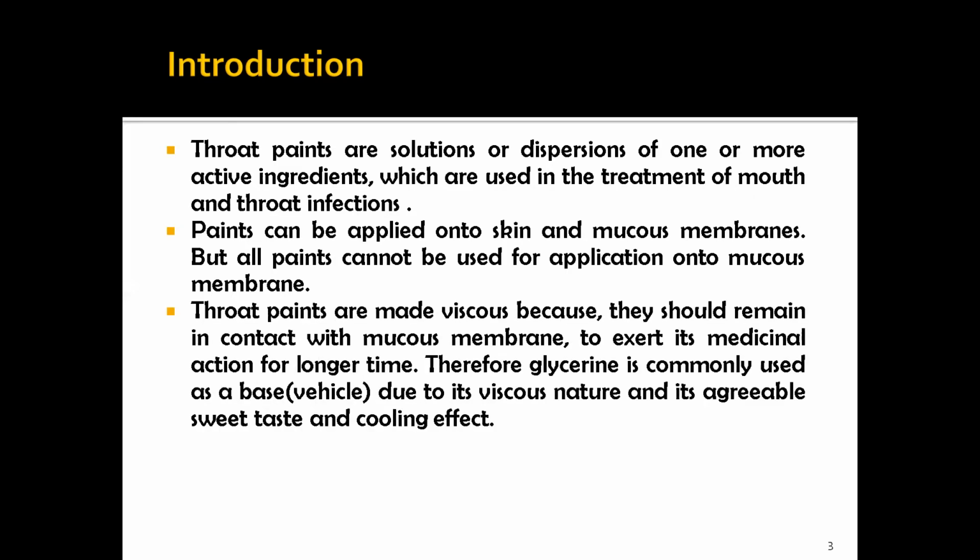Throat paints are made viscous so that they can adhere to the mucous membrane and exert their therapeutic action, and that is the reason why glycerin is used as a base or vehicle for the throat paint.